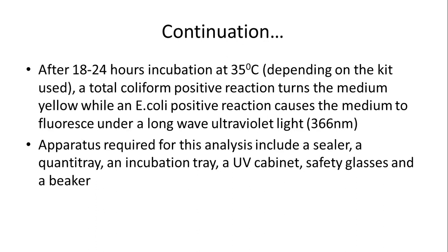So with the microbial analysis, basically what happens is that you will take about 100 milliliters of the sample water to be tested. Okay, first off, when collecting your sample for microbial analysis, it needs to be stored in a glass bottle. This glass bottle has to be sterilized.